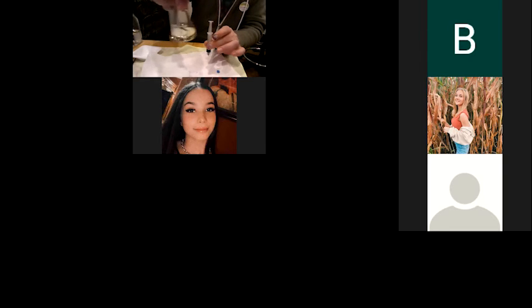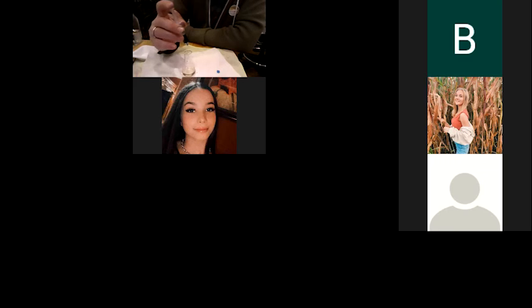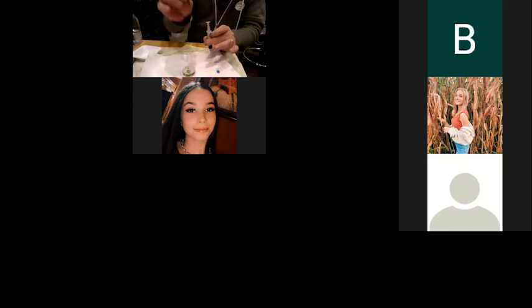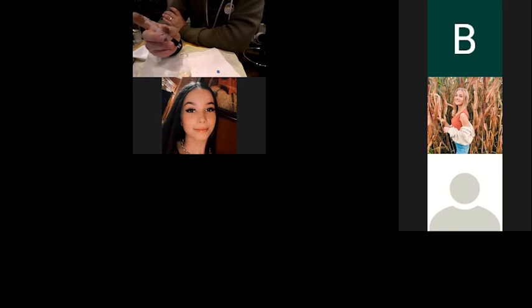So again, there it goes back. So I've used about 2.5 mils so far. I'm still not there. But one thing you'll notice as you're doing this is that when you first start, the blue will disappear immediately. Now you see this hanging around a little bit more. And as it hangs around a little bit more, that tells you that you're getting close to the equivalence point. And the equivalence point is when the moles of DCPIP equal moles of vitamin C, and then you're done.